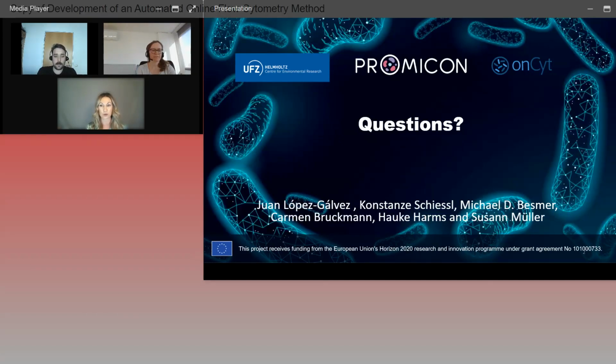Okay, let's get started. We have some great questions that have already come in. Konstanze, I'd like to start with you on this question. For this project, you investigated a prefixed community. What will happen when you monitor a growing community? Did you expect large shifts in the flow cytometry signal as cells move along the growth cycle?